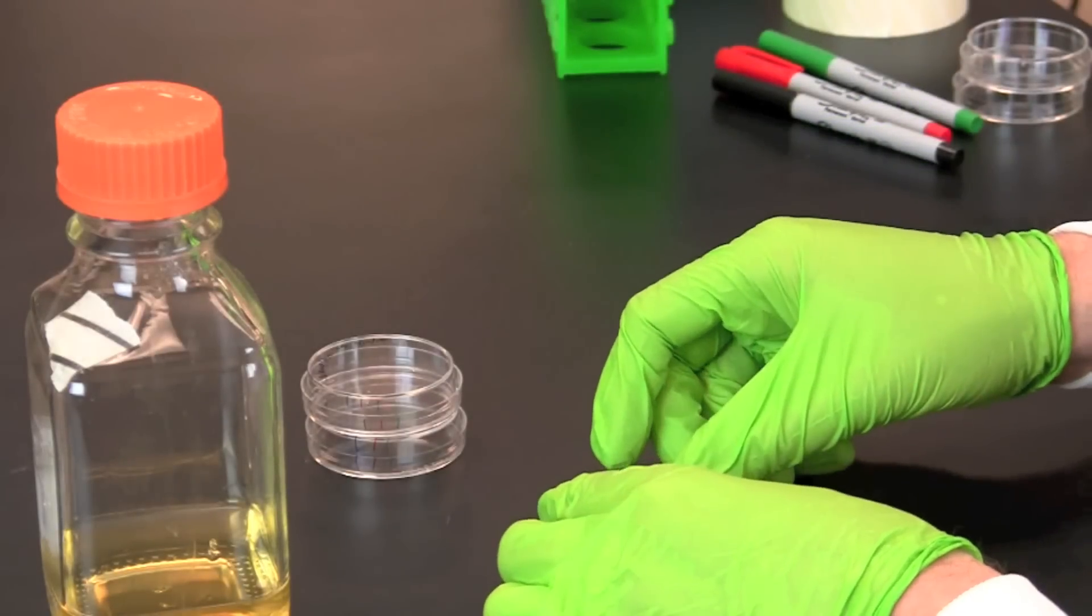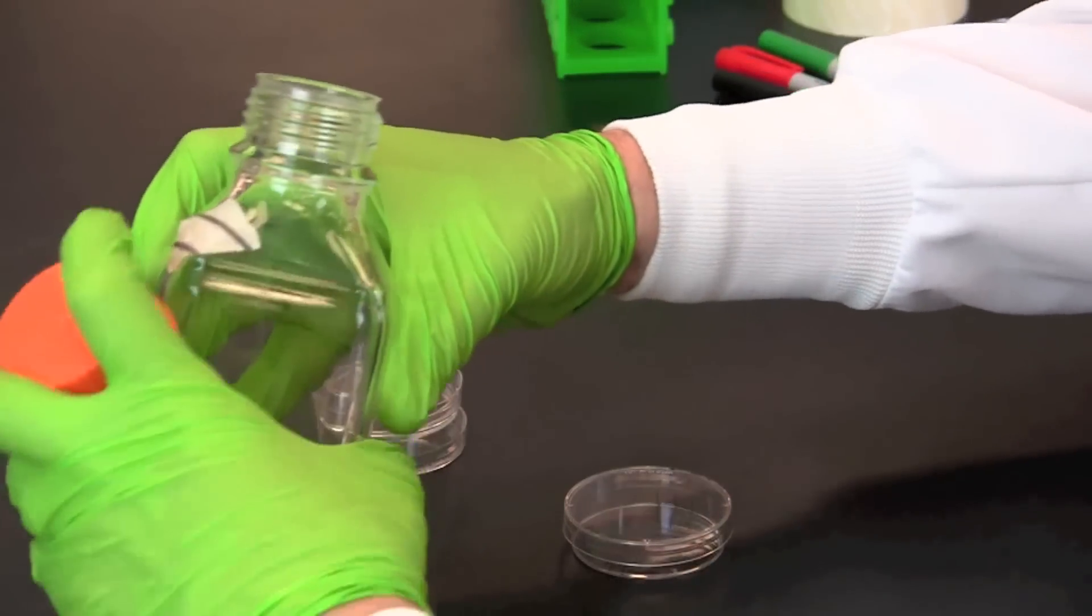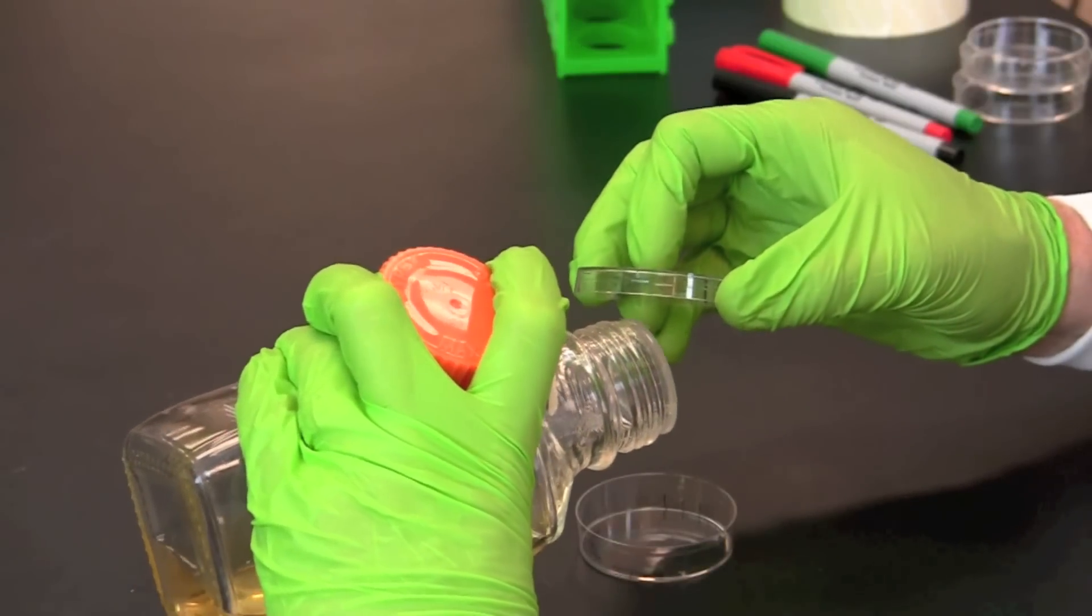To pour a plate, turn the plate with the base on the bottom. Use aseptic technique and hold the lid of the plate to shield the base against contamination while pouring the LB agar.